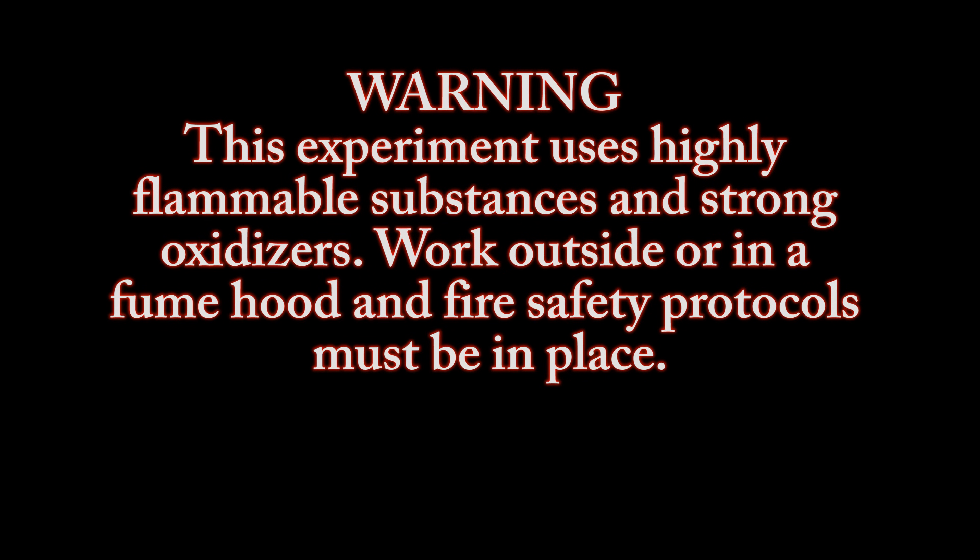Warning: this experiment uses highly flammable substances and strong oxidizers. Work outside or in a fume hood, and fire safety protocols must be in place.